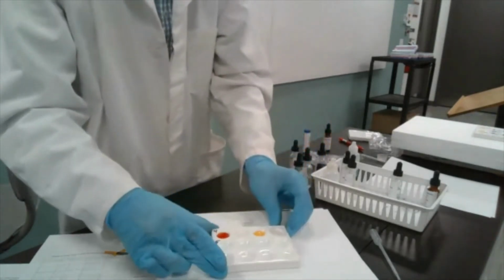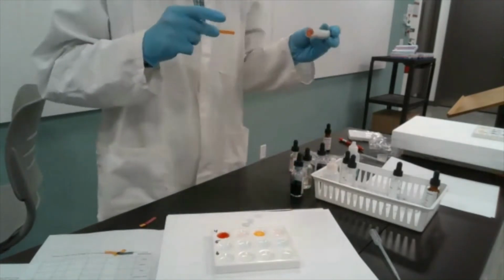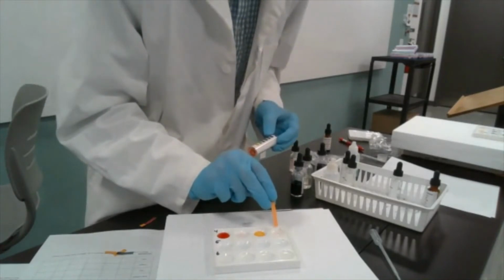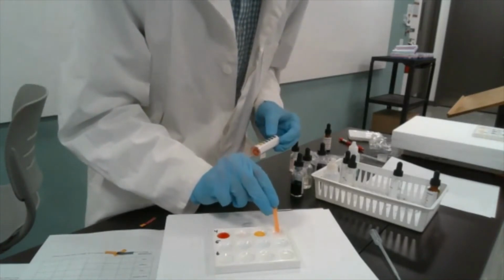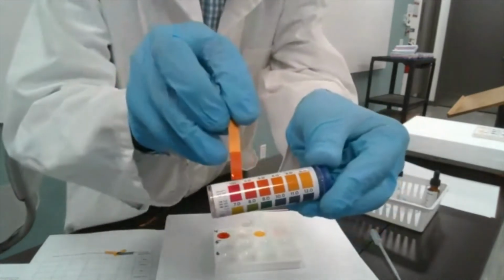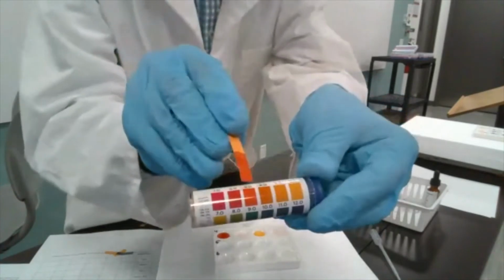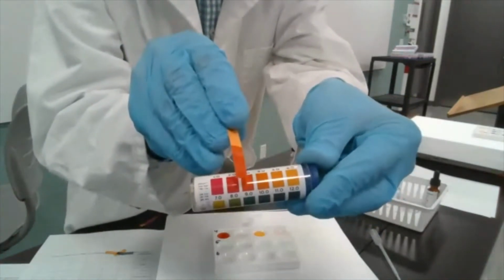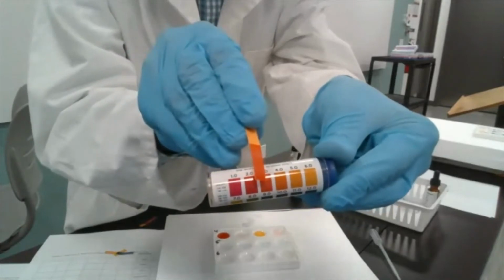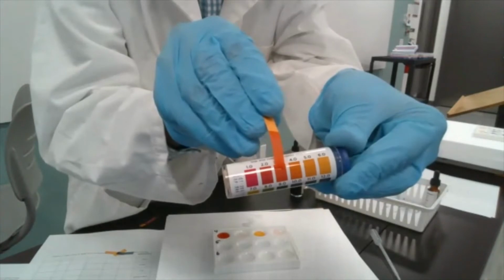And let's dip our indicator paper into this grapefruit juice. Now, we kind of need to work quick. That's why I don't pre-mix it with our test substance. Let me just distribute this evenly. Let's look at the pH chart. What does it look like to you? Probably 3. Yeah, maybe like 3.